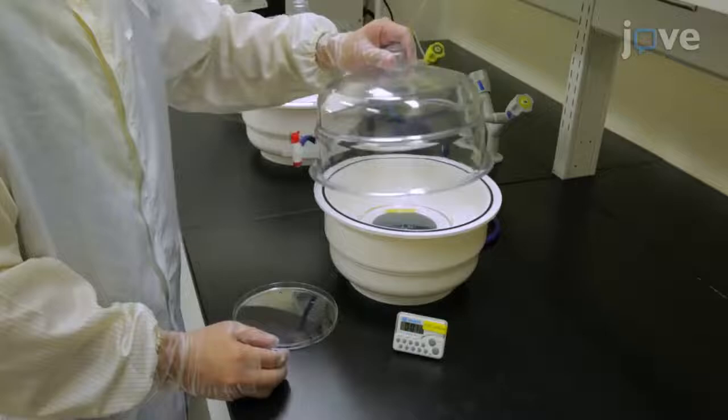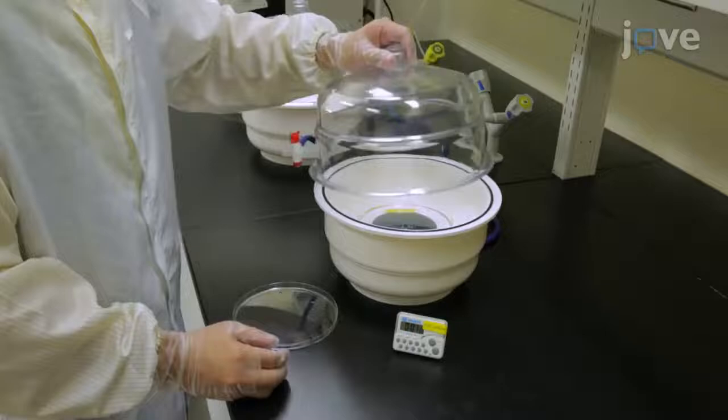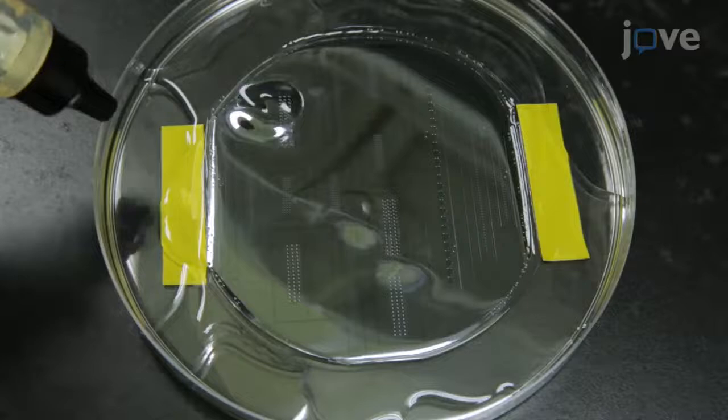Place the 15 cm dish into a desiccator and apply a vacuum for one and a half minutes. Then remove the dish from the desiccator and eliminate residual air bubbles in the PDMS with nitrogen gas.